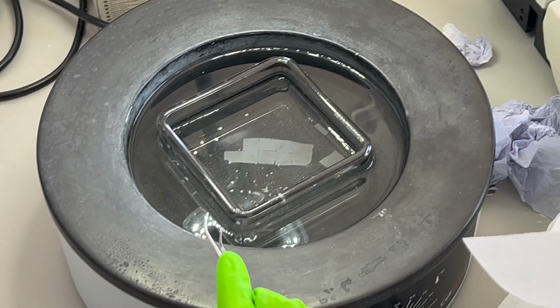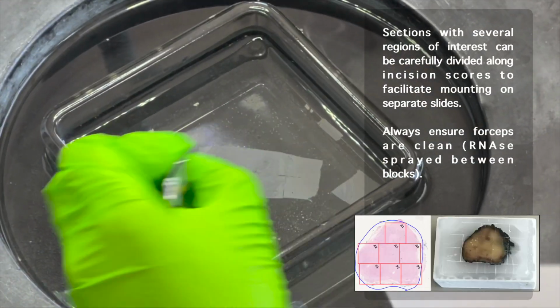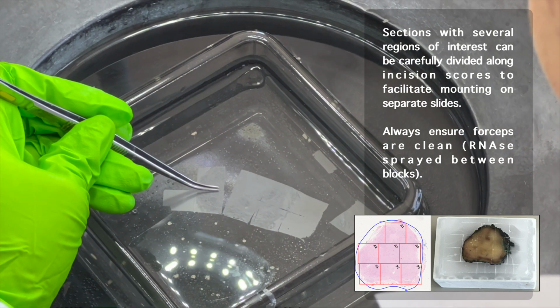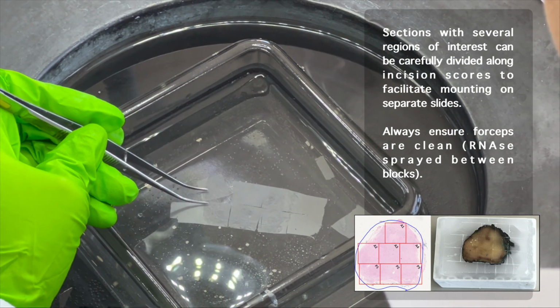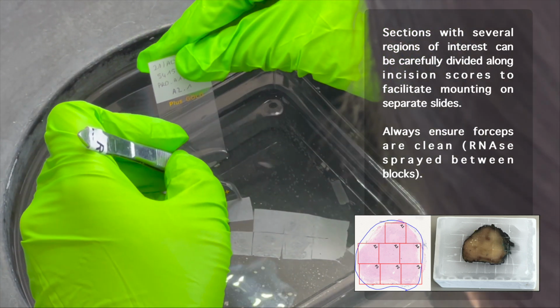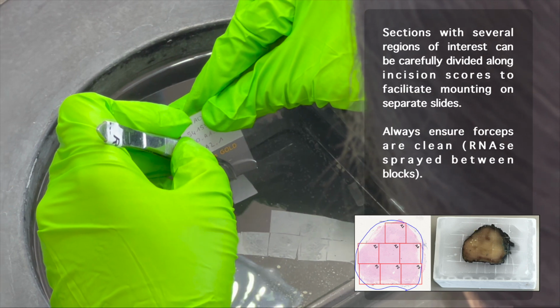In the next part of this video, we'll explore a range of challenges we faced when preparing FFPE section for spatial transcriptomics. As a bonus feature, we've also included solutions to overcome them. For larger sections, such as the prostate axial disc, with multiple regions of interest to be mounted on separate slides, the sections can be carefully separated along the incision scores using a forceps when in the water bath.